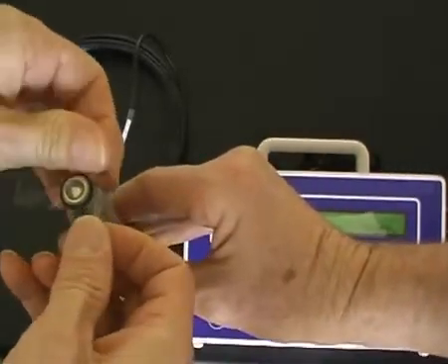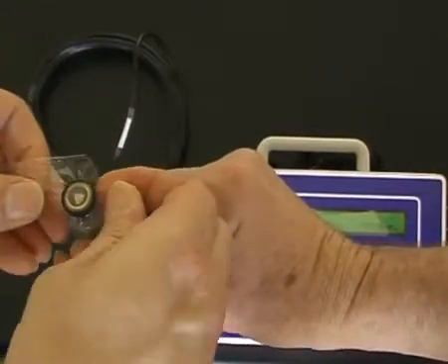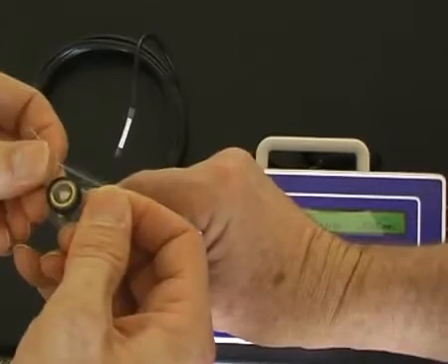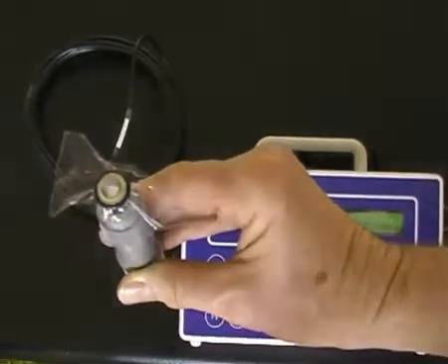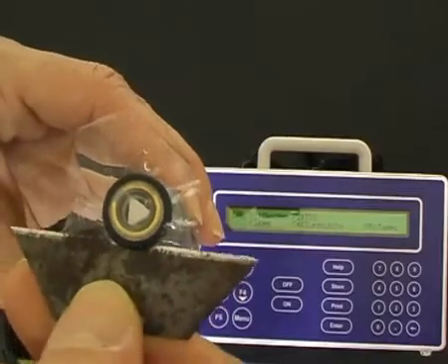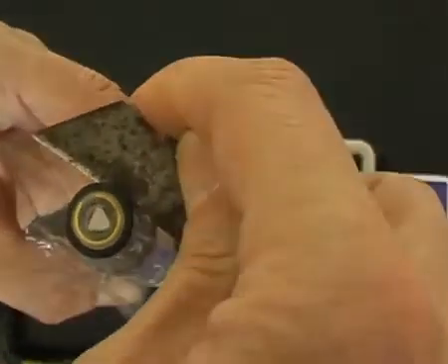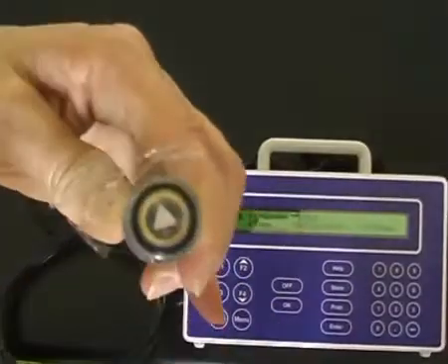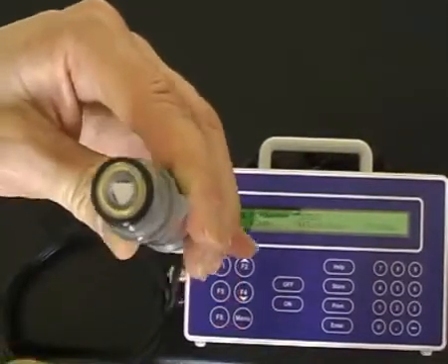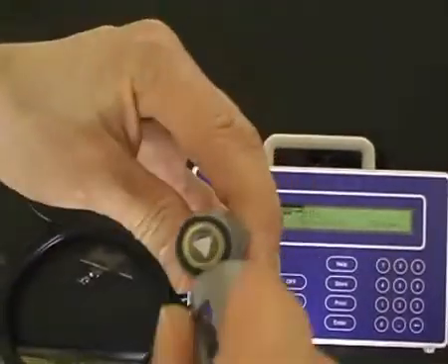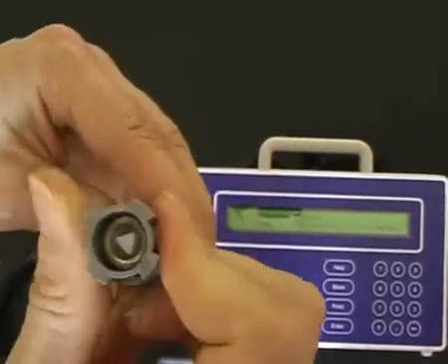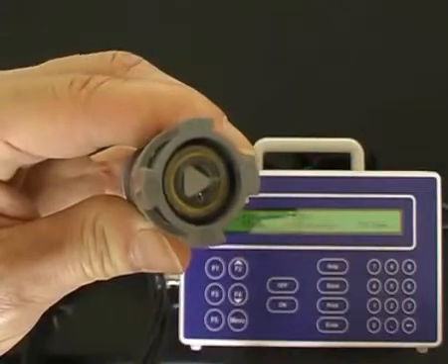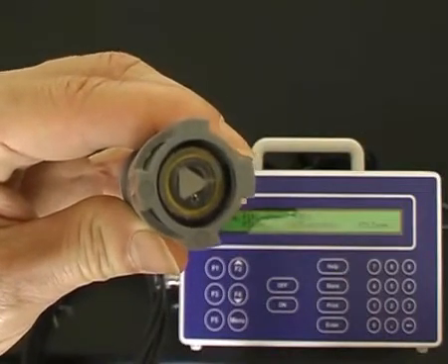Ensure there are no wrinkles in the membrane by stretching from the side and that there are no bubbles underneath the membrane. Then remove the excess membrane from the sensor with a utility knife blade and refit the guard. There should be no bubbles in the filling solution beneath the membrane.